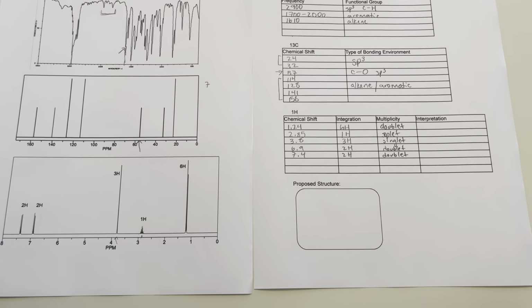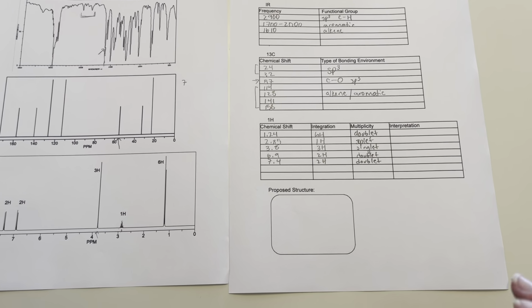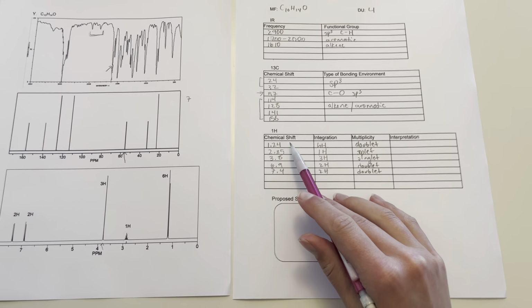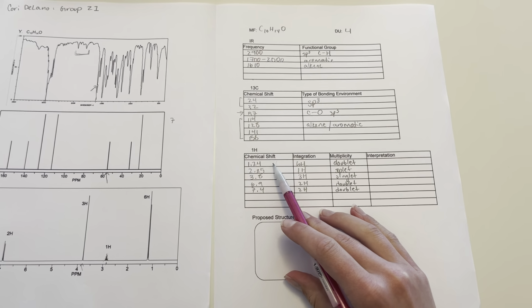Okay, finally we want to move on to the interpretations and then predict our structure. If we have 6 hydrogens that are a doublet at 1.24 parts per million, we know they're sp3.